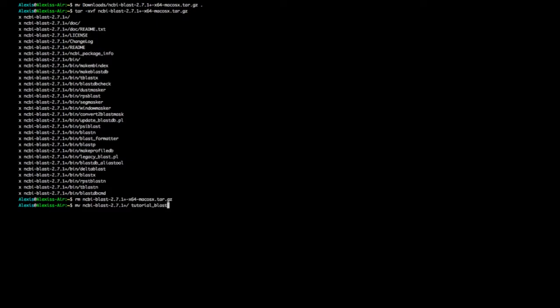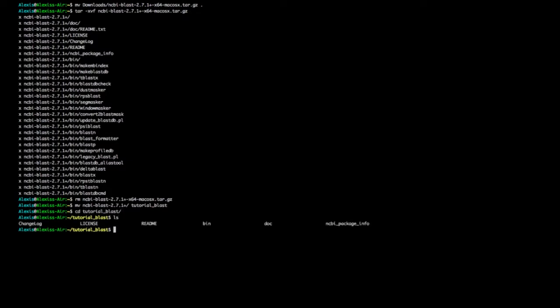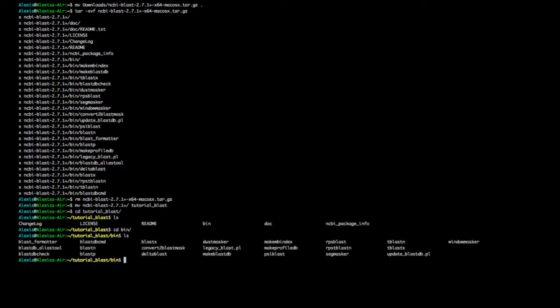Now I'll cd into the tutorial_blast directory and show you what's in there. There's a readme, license, and changelog, but what's most interesting is the bin folder. Once you're inside the bin, you can see all the software accessible to you. There's something called the PATH that allows the computer to access files from that directory anywhere in the file tree.